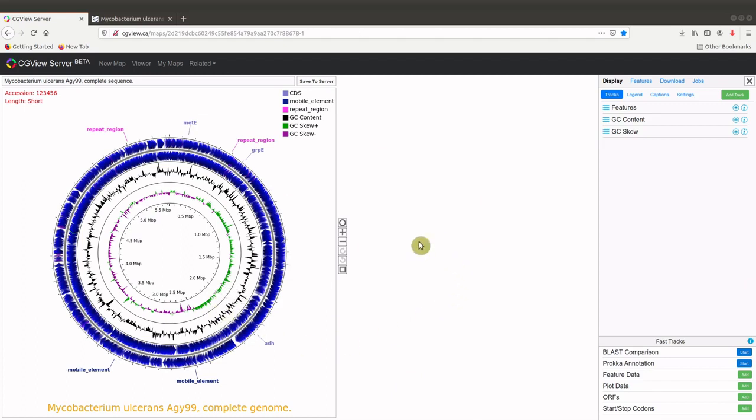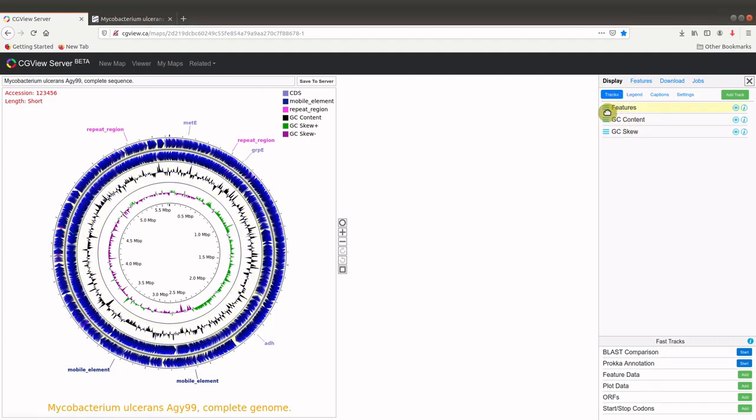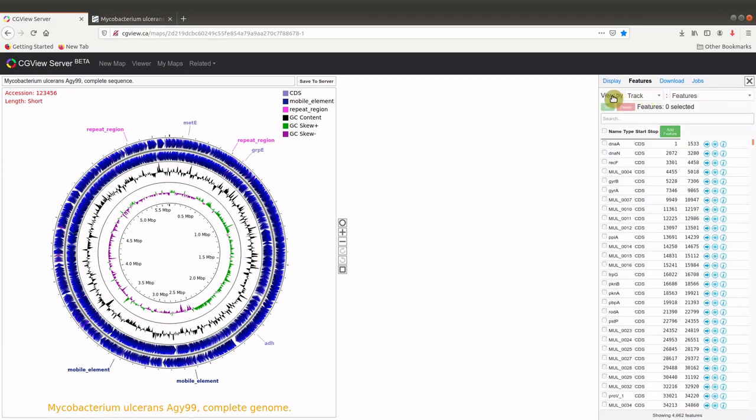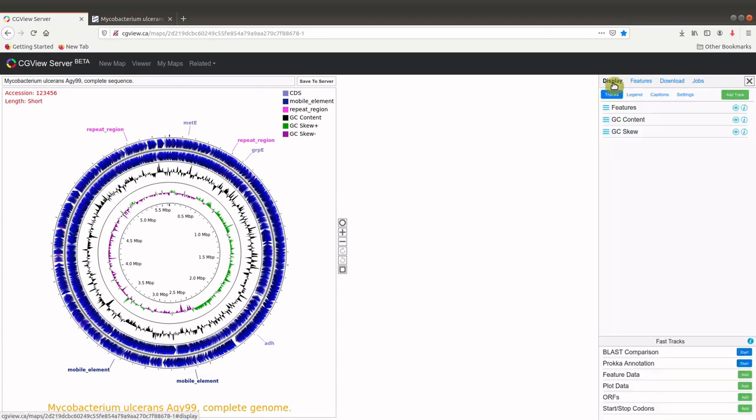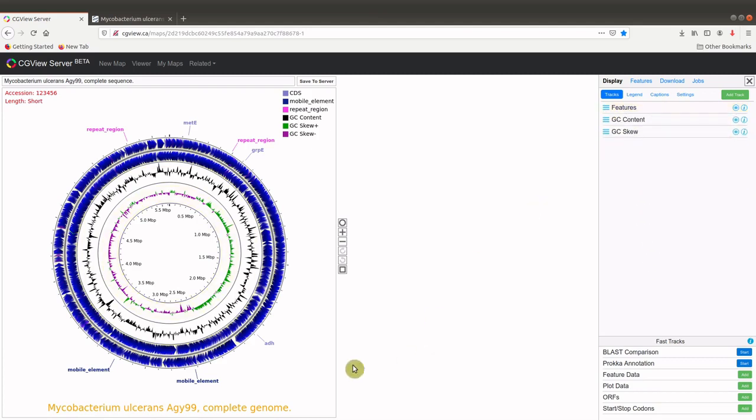You should also note that with the genome map with the CDS, you have the forward and reverse strands here. That's what we have here, these two. But if you want to make changes to it, you can just go to the display features. CDS here, the strand here is separated. And then make some changes if you want to, but we will leave it at the default settings.